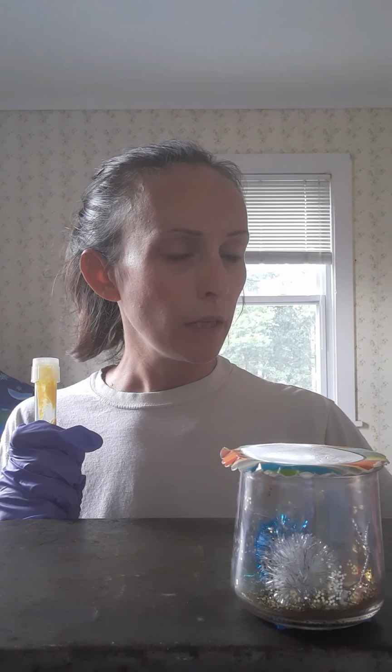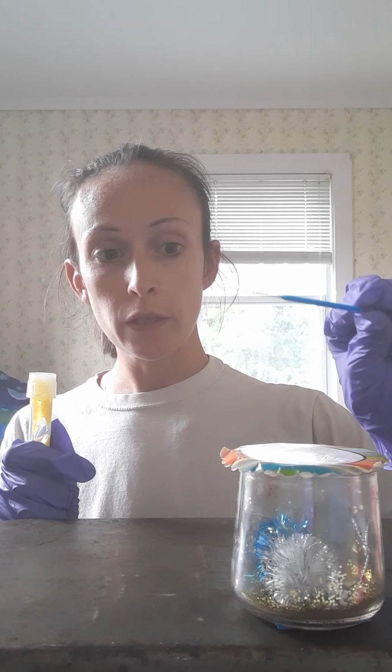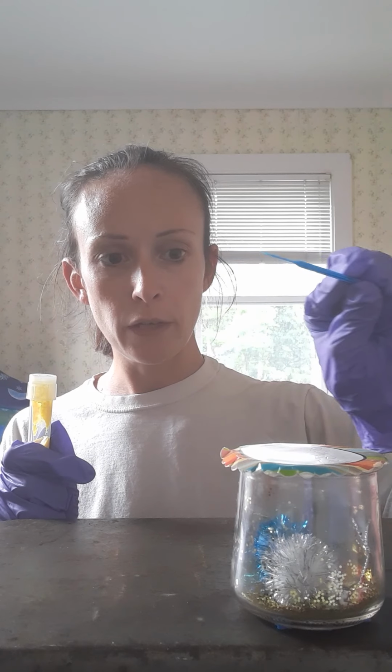So again, we did aseptic technique, labeled everything, and so what we're going to do is first we're going to take our culture, and we're going to make sure that we sterilize our loop through the Bacto incinerator. So we're going to do that.